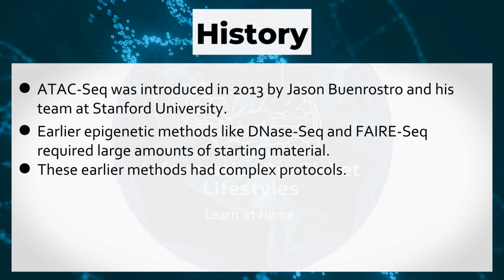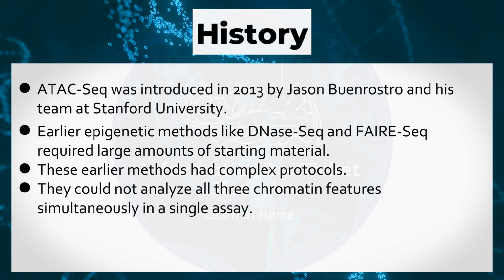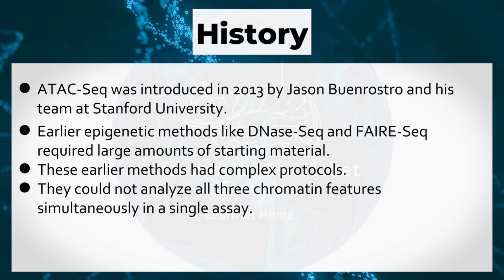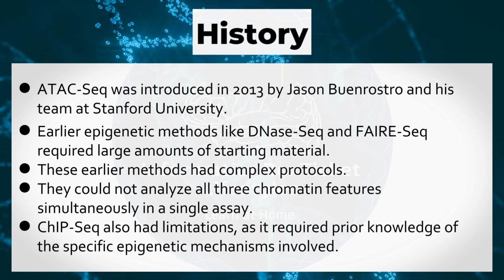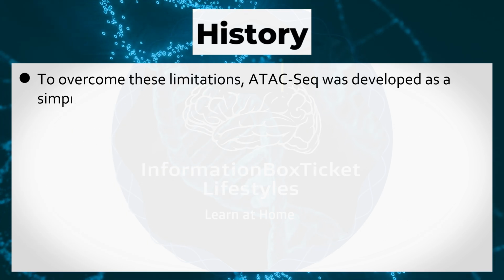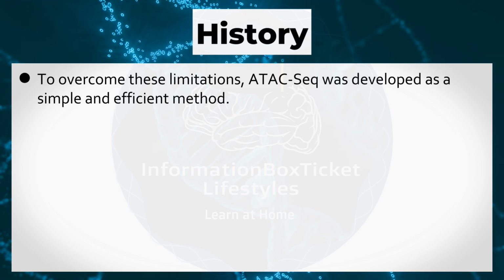These earlier methods had complex protocols. They could not analyze all three chromatin features simultaneously in a single assay. Chromatin immunoprecipitation sequencing also had limitations, as it required prior knowledge of the specific epigenetic mechanisms involved. To overcome these limitations, ATAC-Seq was developed as a simple and efficient method.